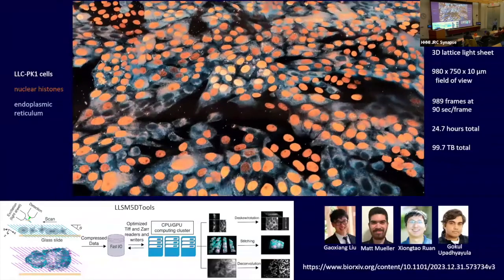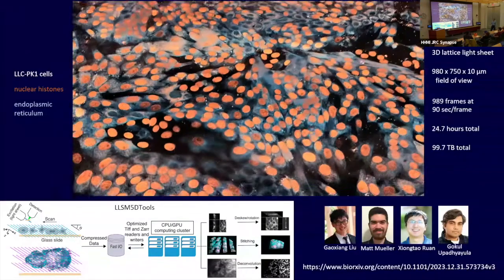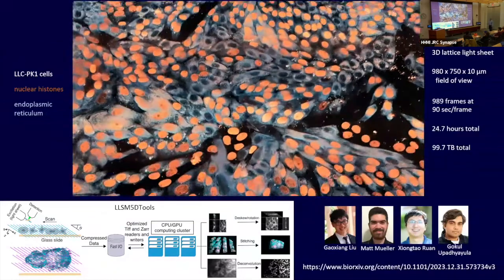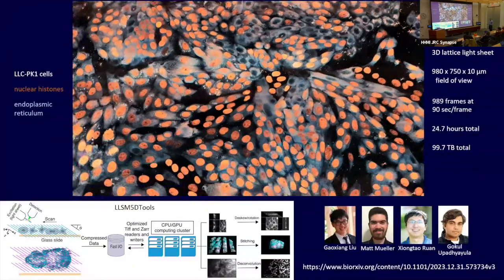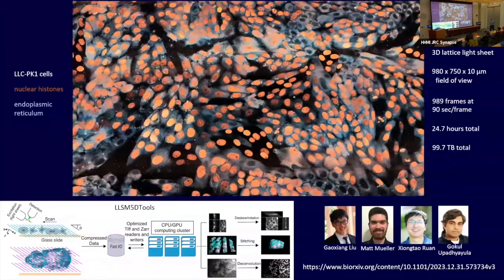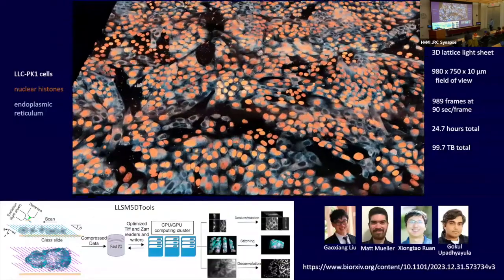So Zhang Tao and Matt developed in our Advanced Imaging Center at Berkeley the means to take light sheet data at that speed, compress it, convert either to TIFF or Zarr formats, and then do first a deskew rotation of the raw data, then stitch different tiles together with different adaptive optics corrections in each tile to deal with the isoplanatic patch problem into a single volume, and then deconvolve that.